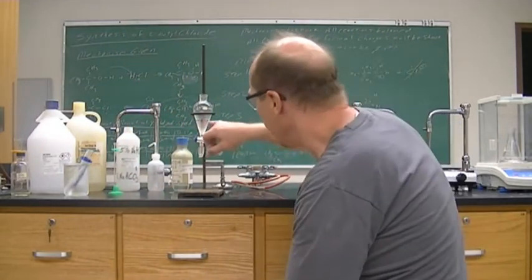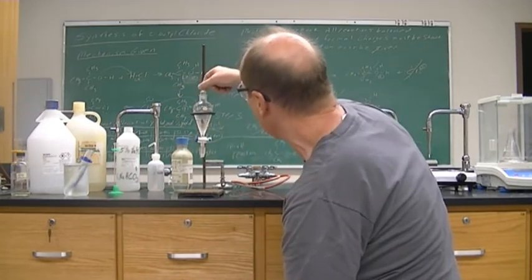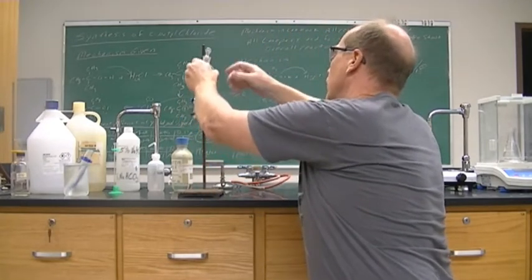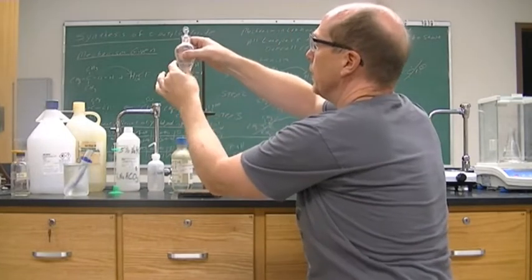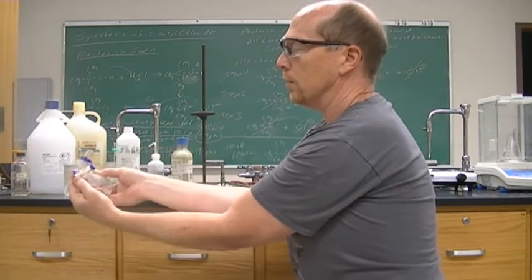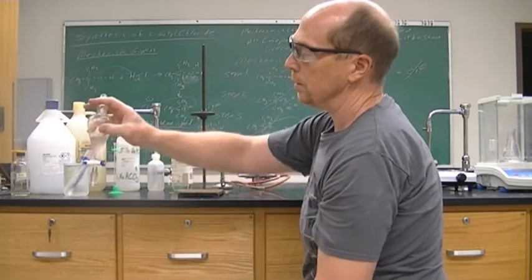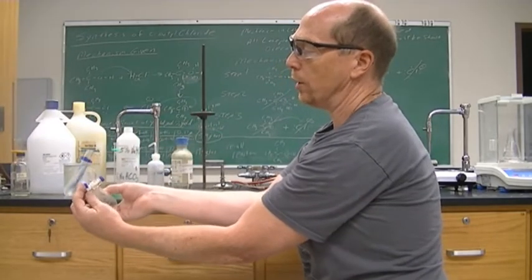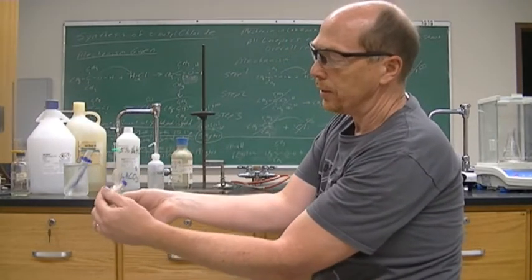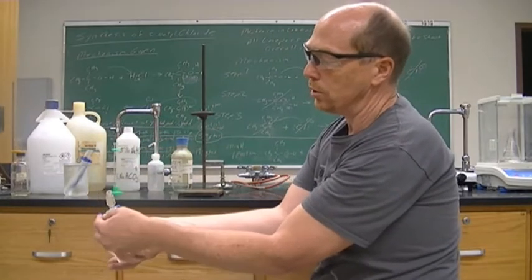And so you can see there, well, I don't know if you can see, but it looked like it was 2 layers, but it could have just been the hydrochloric acid being so cold that it made it a frosted glass. Again, we will vent. Since we made the hydrochloric acid so cold, it's going to react slower. You're not going to hear any swishing noise, and we're not using a volatile organic solvent.